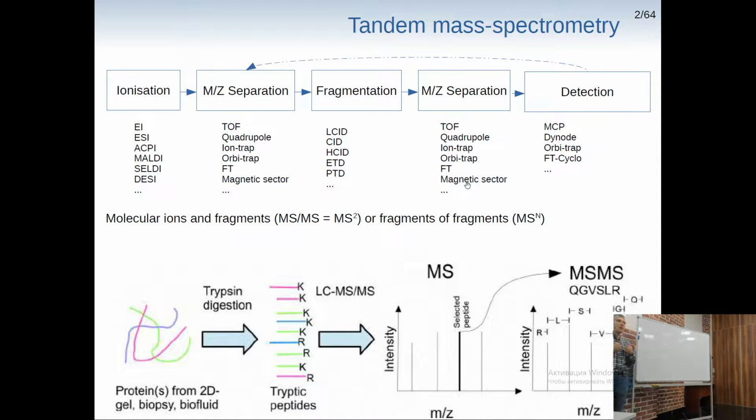The same is true for most biopolymers, because in biopolymers, it's the link between monomers which fragments more easily than the building blocks themselves. For instance, for nucleic acids, the bond between the nucleotides is the easiest to fragment. For proteins, it is of course the peptide bond, which can also fragment more easily than any other combinations.